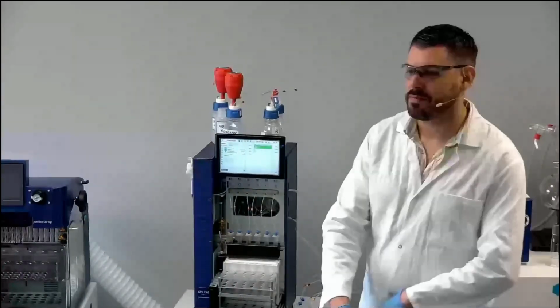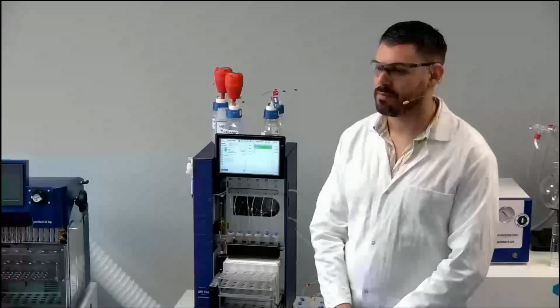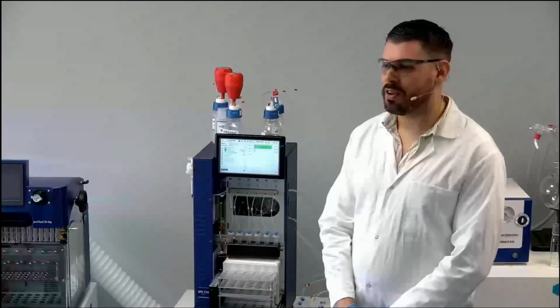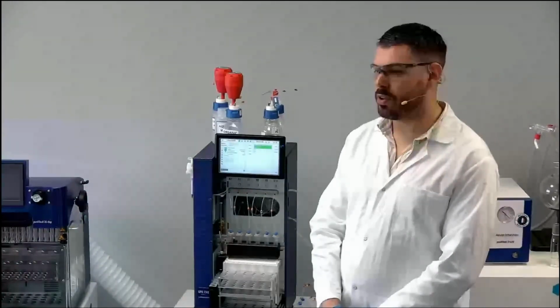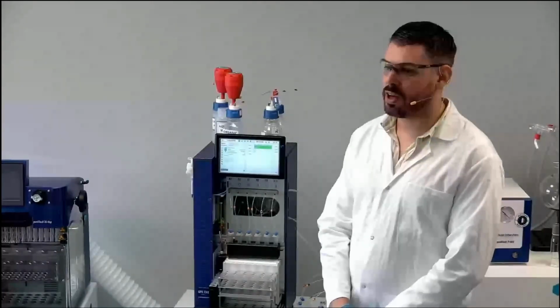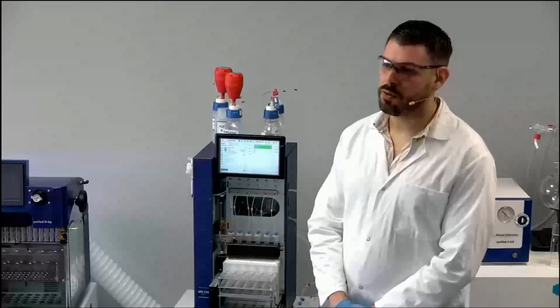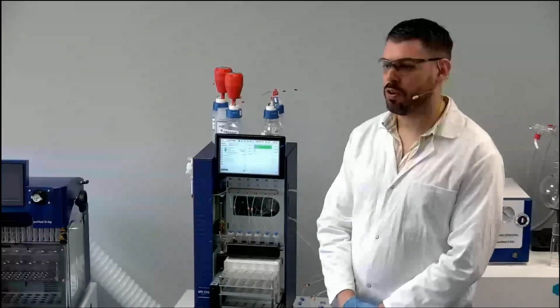So it looks like we have one more question for you, Benjamin. It says, do you use gas to push the solvent through the sorbent? No, for this system, we control the flow rate. Why don't we use gas to push the solvent? Because when you load the sample or your solvent inside your columns, if you push with gas, there is a big risk of drying your sorbent and changing the interaction of your molecule of interest with the sorbent. That's why, when you load the sample or the solvent through the columns, it's a liquid flow and not a gas flow pushing the solvent or the sample through the sorbent.